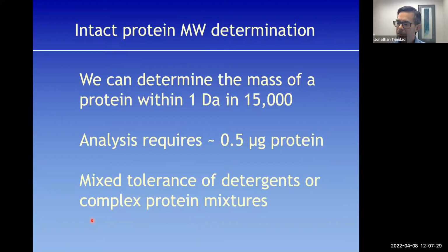If you ever ask a mass spectrometrist about a parameter, they're going to say it depends. So they often ask, well, how much protein do I need? It really depends on the behavior of your protein and the purity. So this is a very conservative estimate. But in a small, well-ionizing protein, we could use 1/100th as much. I try to get people to give me about a half a microgram, which for a protein biochemist is sort of a rounding error on their synthesis. And for just these simple protein IDs, they can handle 1 or 2 or 3 different proteins in the mixture, or possibly more variants.